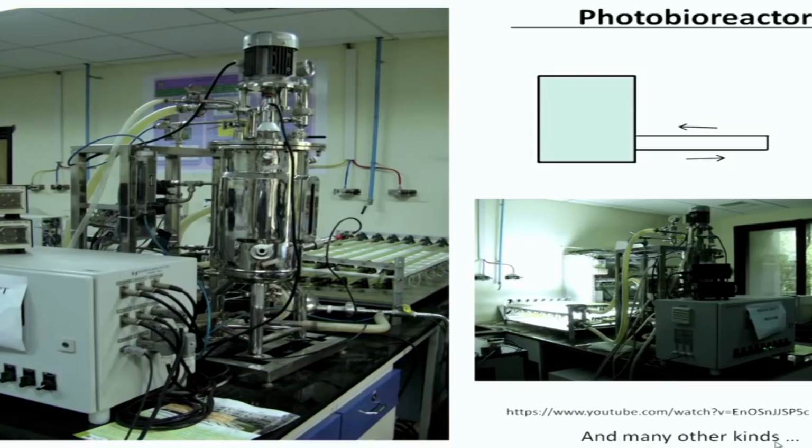And there are very many kinds of bioreactors. It's not possible to go through all of them. These are the common types that are used for producing useful products through the biological route, and you have seen some of them.